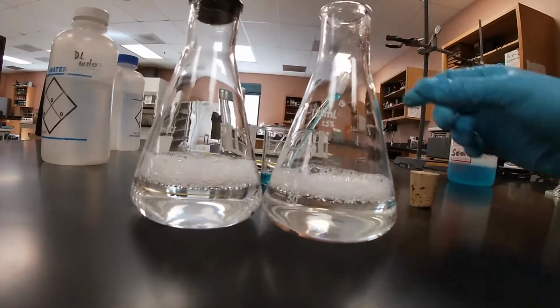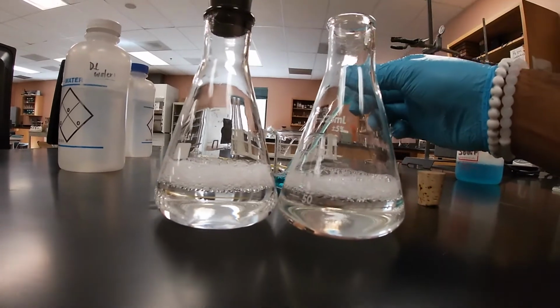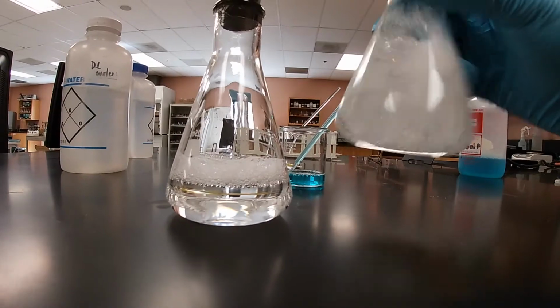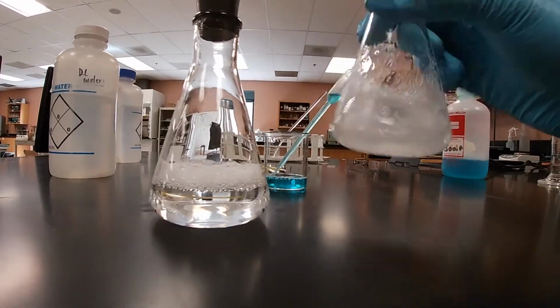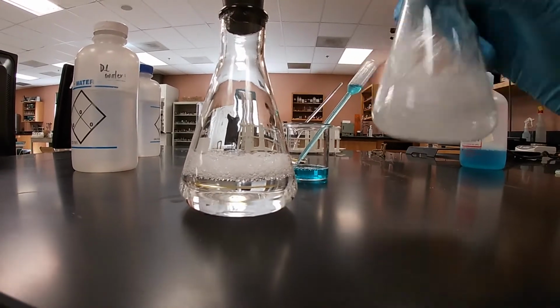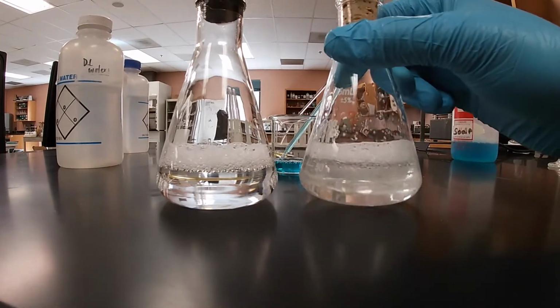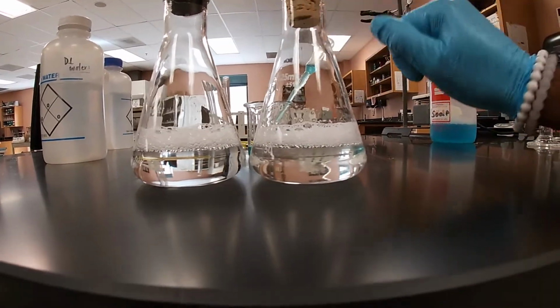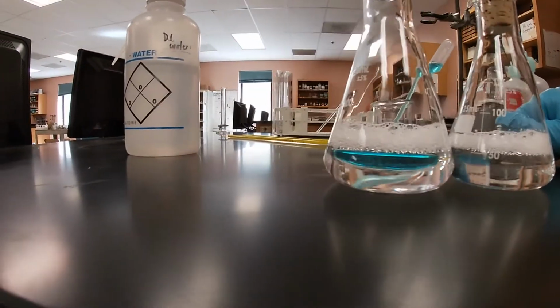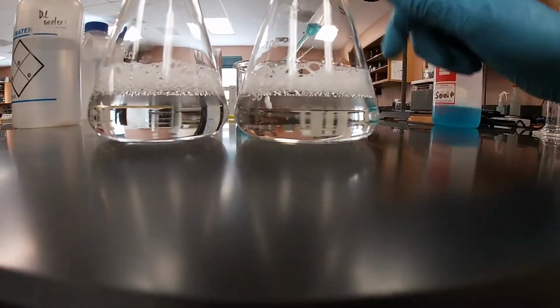Go ahead and add another drop. One more. Okay, another 10 seconds. 1, 2. I think we're almost there. I believe maybe one more and we should be there.